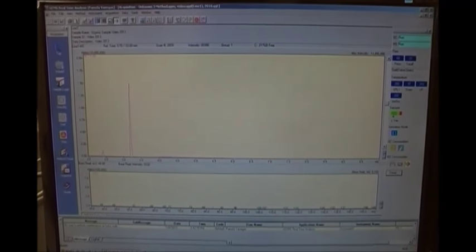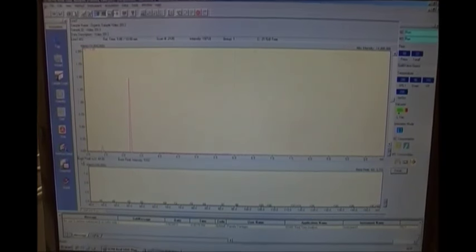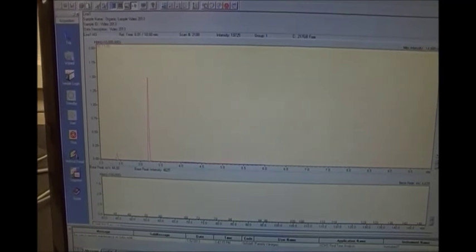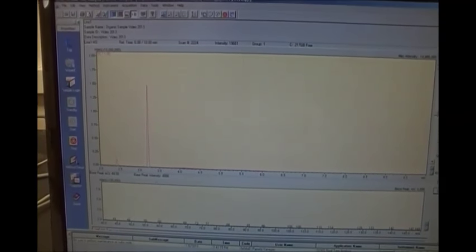Okay, so this here is the results we're getting from our GC-MS and this is in real time. If you look here, you can see that our detection starts at two minutes. This first peak here is contamination and the second peak here is the compound that we're looking for.